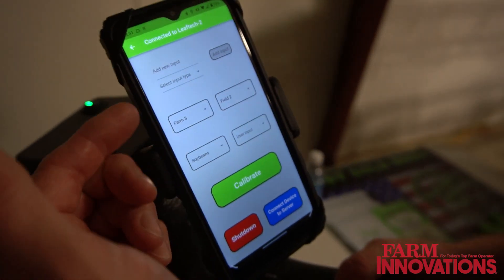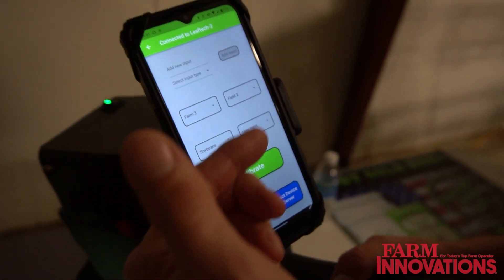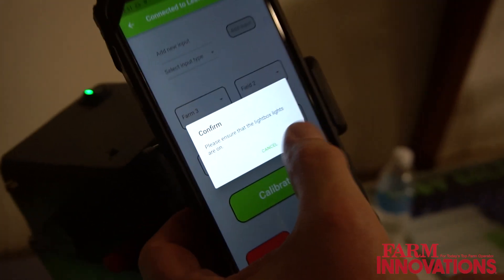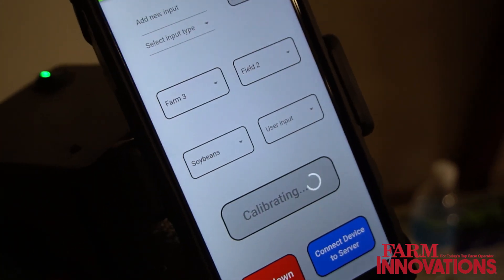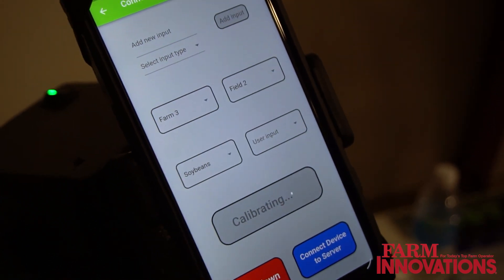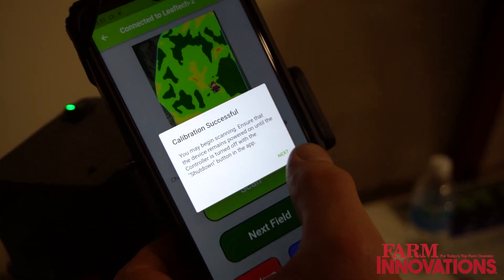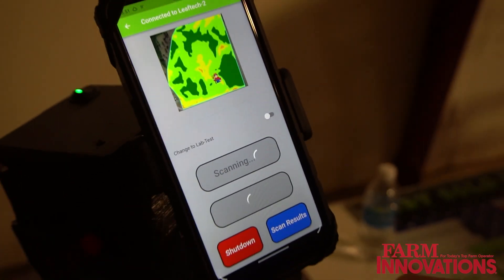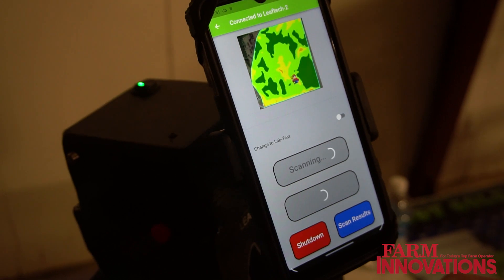This system allows you to identify your farm field crop and then calibrate that at the scanner with that information. From there, you are able to capture the leaf non-destructively to look at the nutrient content.